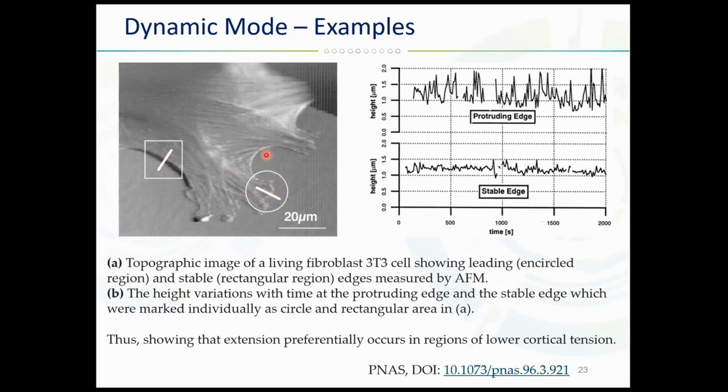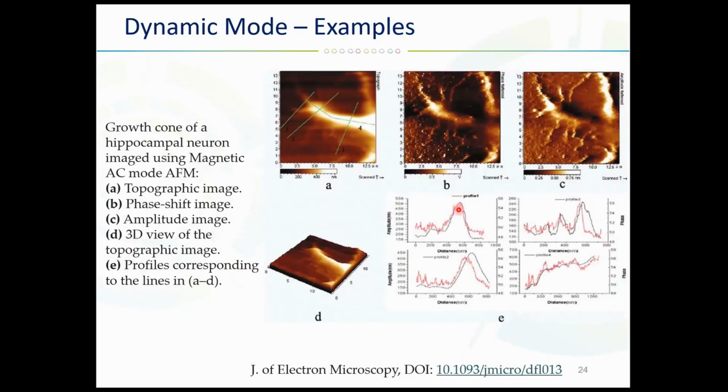This again, so this is how we can check the motility of the cells. Before explaining what you can see here, just a few words about the background of this image. This is the work of checking the living hippocampal neurons in the physiological conditions. The reason why the researchers were interested in the hippocampus is because it is associated with memory processing in mammals, and this structure will degenerate in patients with Alzheimer's disease.